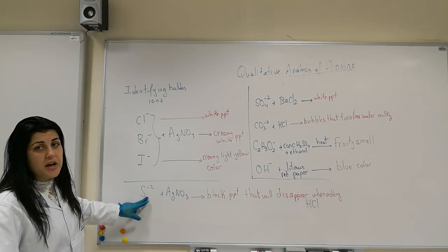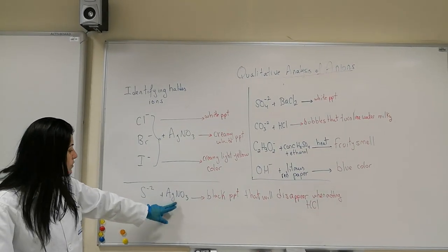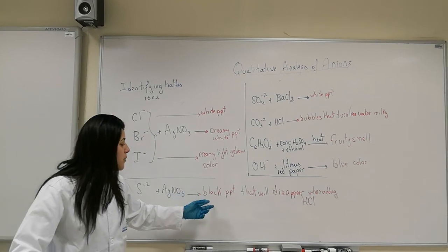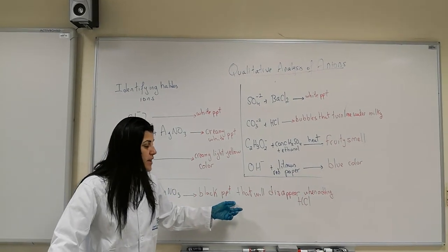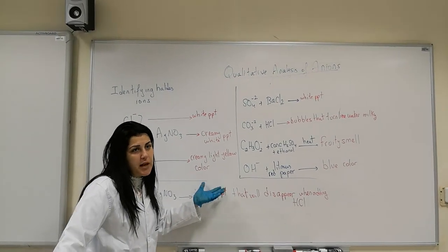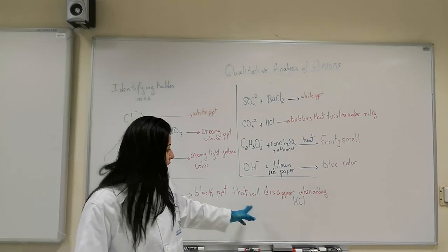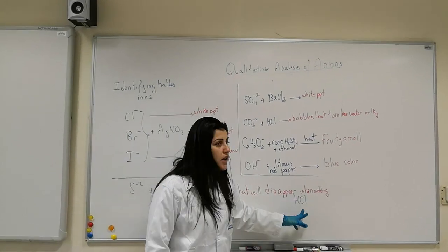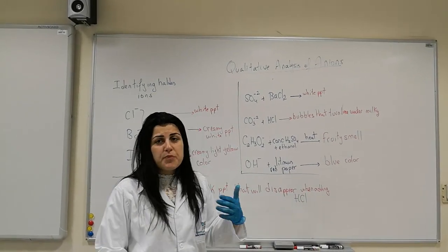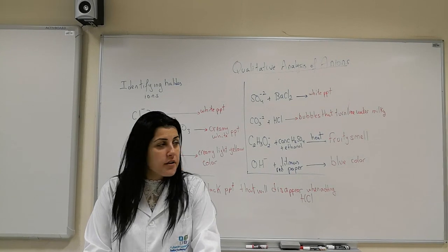For another anion, the sulfide, we are going to add silver nitrate. A black precipitate will be obtained, and this black precipitate will disappear if we add hydrochloric acid to it.